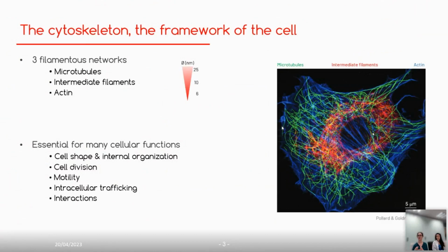They propel from the center, from the nucleus, and go all around the cell. And the intermediate filaments have an intermediate diameter, which are the ones in red here, and they are about 10 nanometers in diameter. And the microfilaments of actin, which is very well known and extensively studied, form a cortex all around the cell. And you can see it in blue on the image.